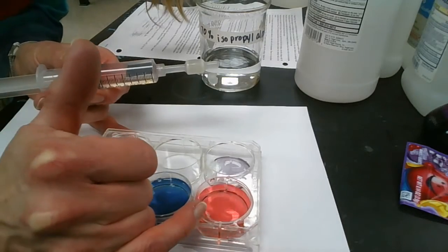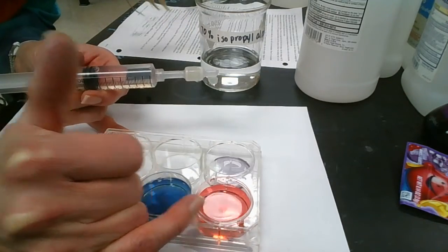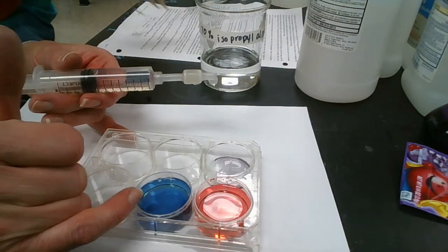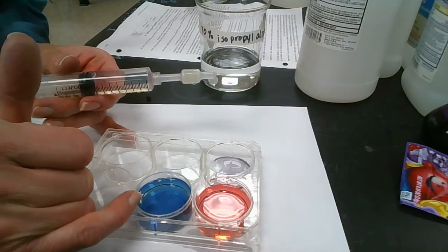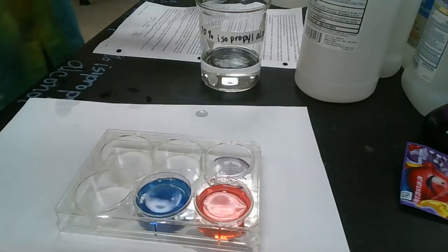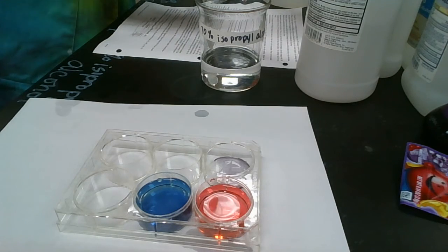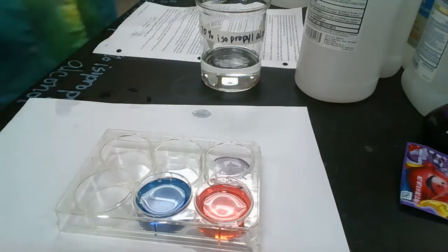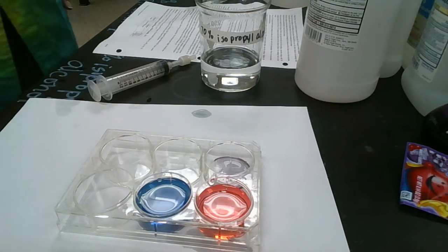So 5% isopropyl alcohol brought off that red dye. I switched to 25% isopropyl alcohol, and I brought off that blue dye. And so I'm going to put the rest of this in my waste beaker at this point. And I will have to clean my column off with some water and some 70% isopropyl just to make sure that everything comes off of that column.